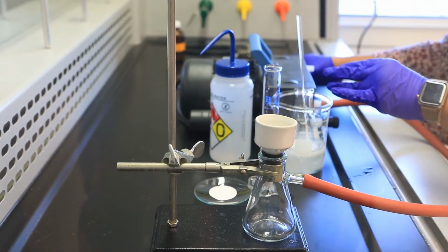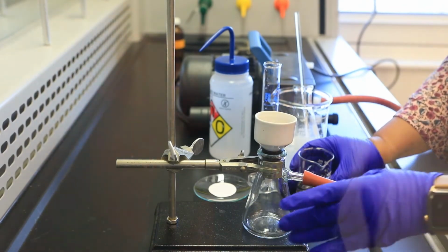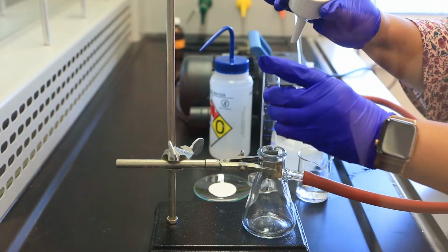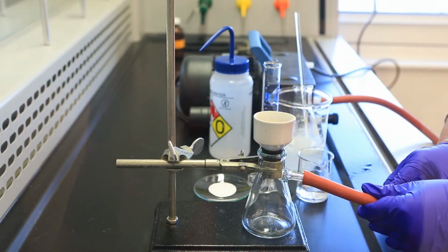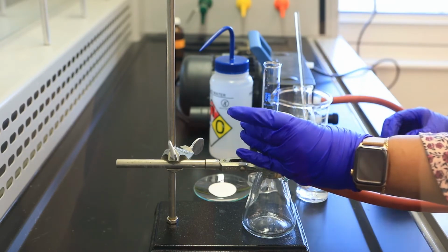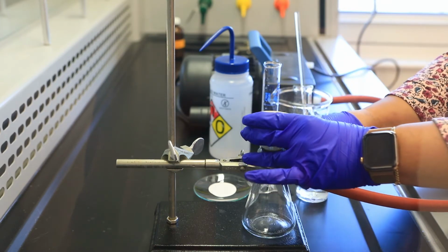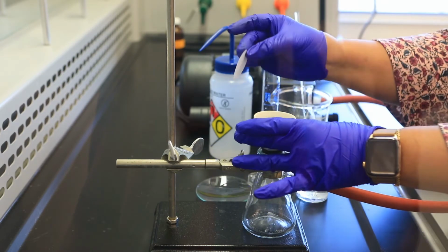In the meantime, I'm going to prepare our vacuum filtration setup. Here I'll need a filter flask. We also need a Büchner funnel and a filter adapter, and this is connected to our vacuum pump, which is over here at the line. When I pour the solution with the crystals in and start the vacuum, the liquid will pass through, and our wonderful crystals will remain on the filter paper.